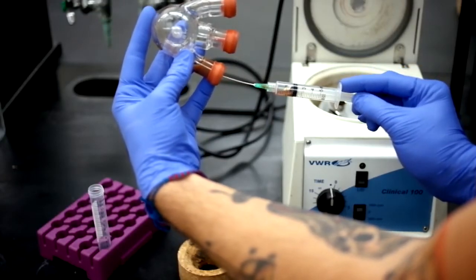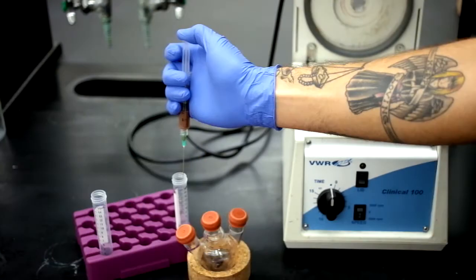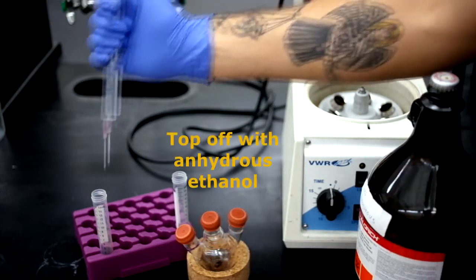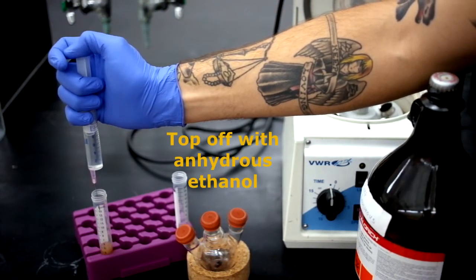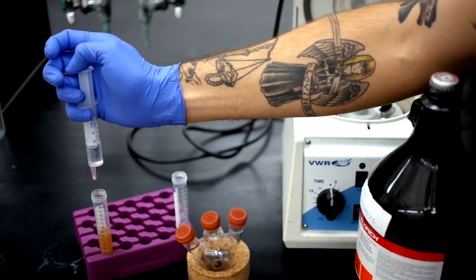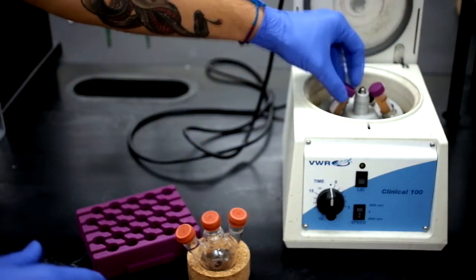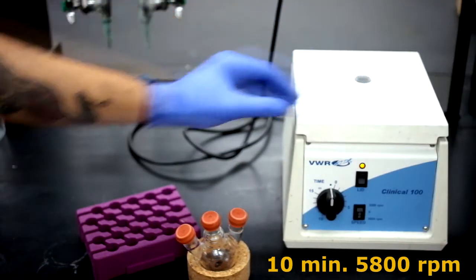Once the reaction flask has cooled down to about room temperature, you can take the product and split it between two centrifuge tubes. Then top those tubes off to 15 milliliters with anhydrous ethanol. Place the centrifuge tubes into the centrifuge and let them spin for about 10 minutes at 5800 RPM.